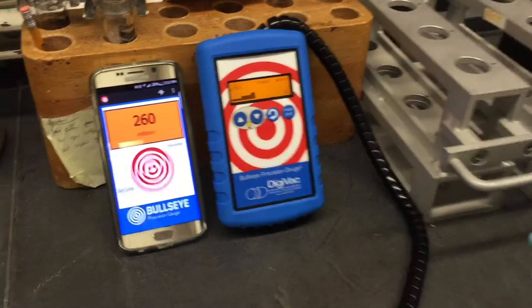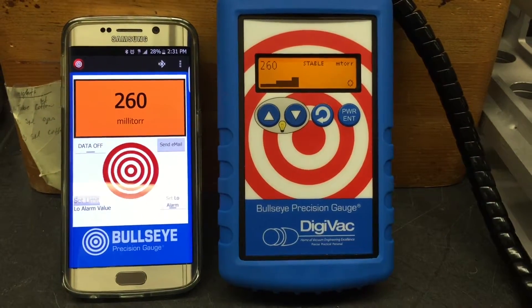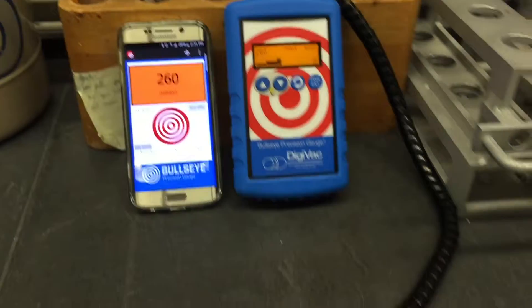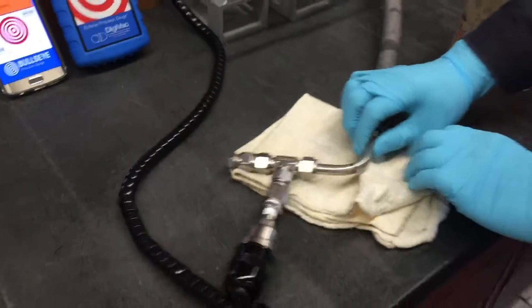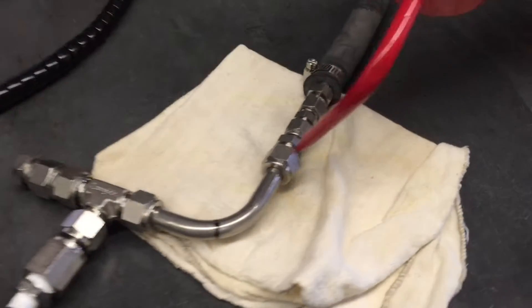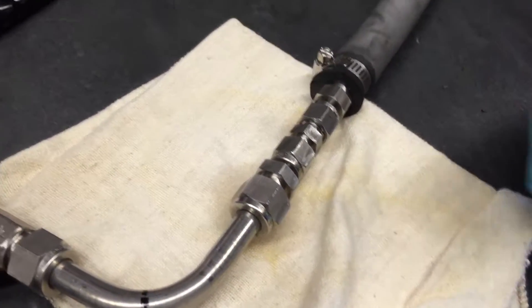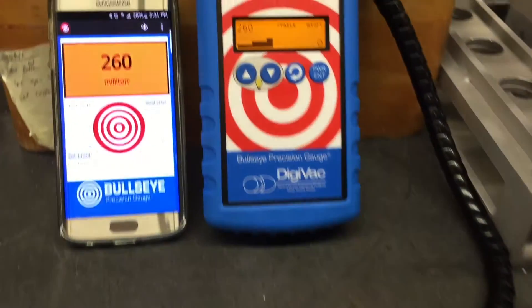Okay, now we have let it stabilize for about 5 minutes and it's stable at 260mm. Now I'm going to spray acetone on the part that I didn't create a leak. And you can see the vacuum is stable at 260mm.